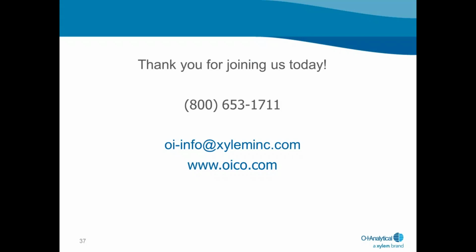Also, wouldn't it be better to use a technique like heated persulfate for analysis of salt-containing samples? Well, that's another one of those all-depends questions. As I've mentioned in previous webinars, particularly the second webinar where we did a comparison of the various TOC techniques, not every TOC technique may be suited for every sample.